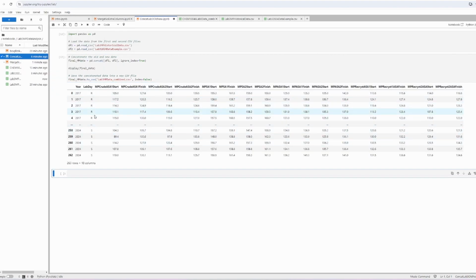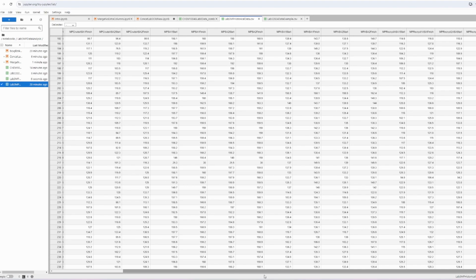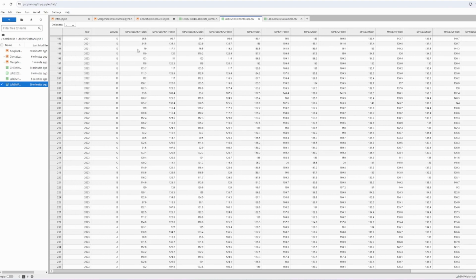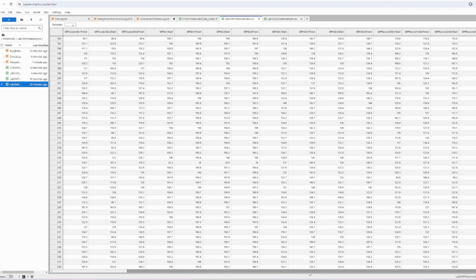So I'm going to run all, and hopefully it works. And so there it is. It spit out the same thing. There's 18 columns here, so it stayed the same. Both of these files have 18 columns. It has so many because, for my example anyway, we've got duplicates. So we've got tube 1 and tube 2, and you're going to find that when we actually run the data, we've got two sets of data for each melting point that we're going to do.